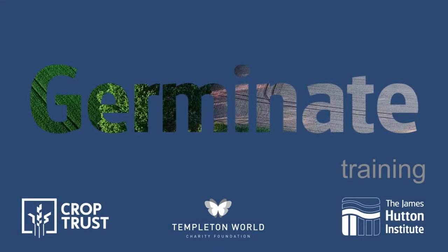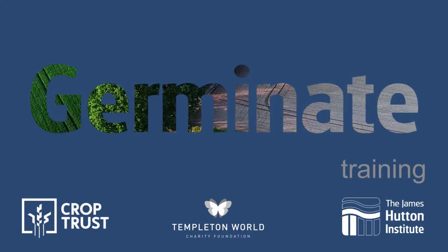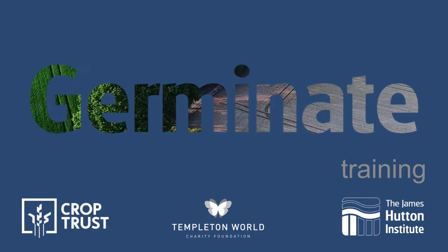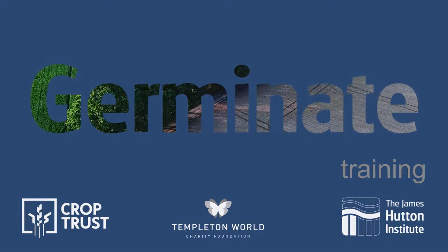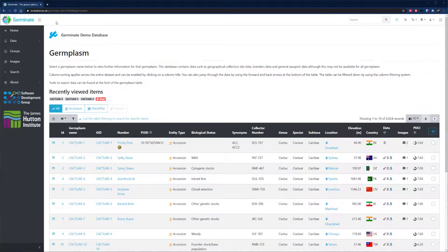Germinate is an open source plant information platform that's used to store experimental data from plant genetic resources collections. This tutorial will guide you through the main components of the Germinate interface. All Germinate databases have the same user interface, so if you become familiar with one, you're familiar with them all.